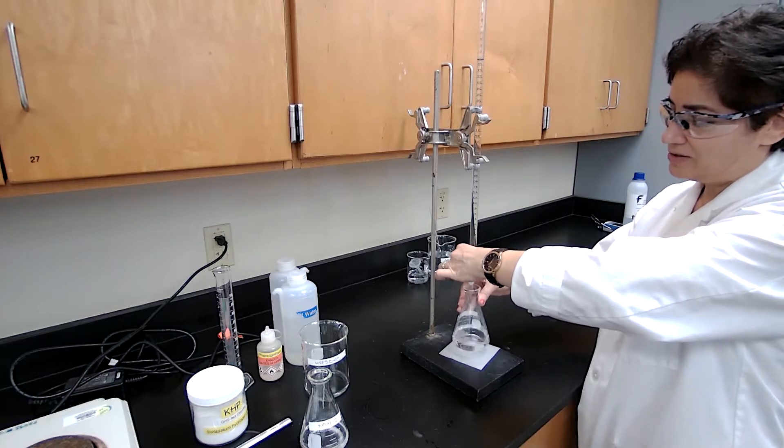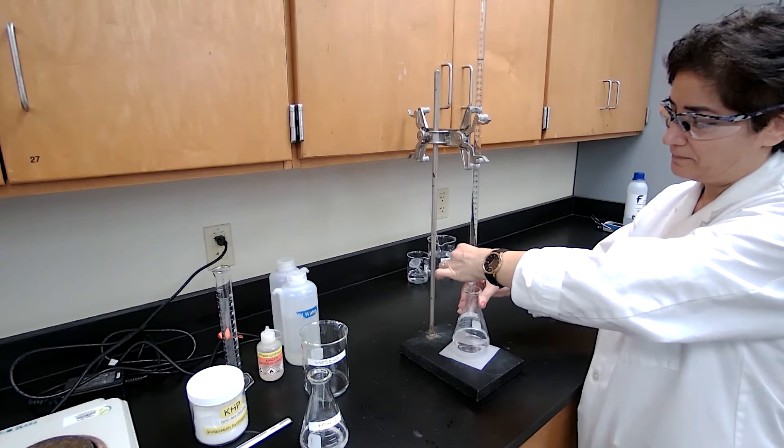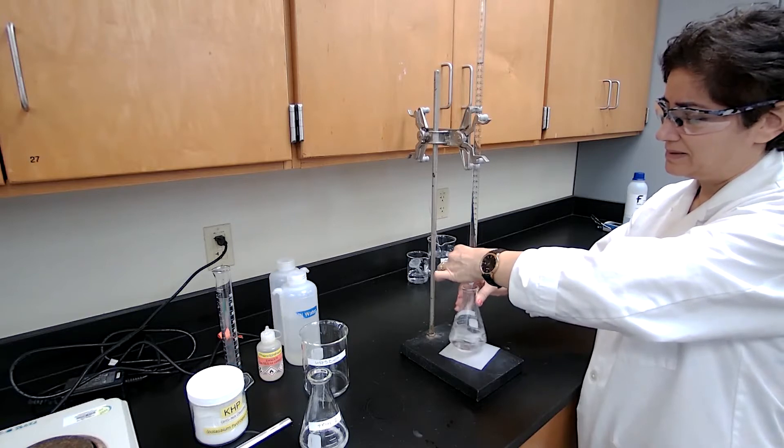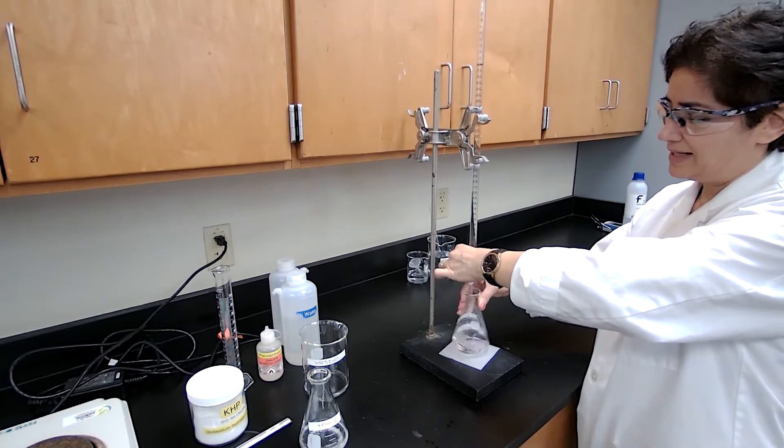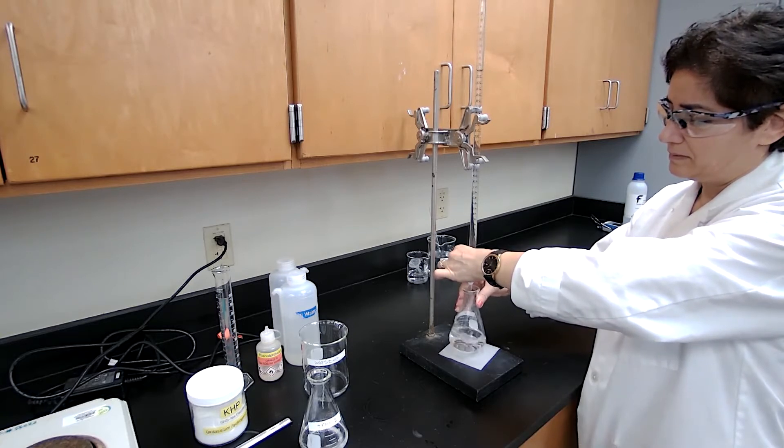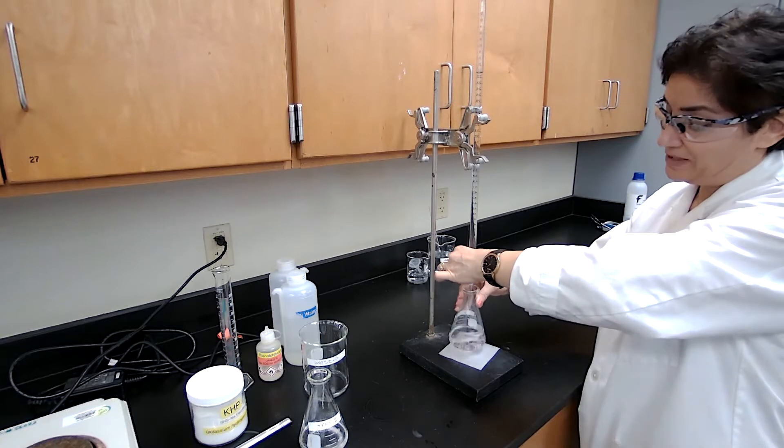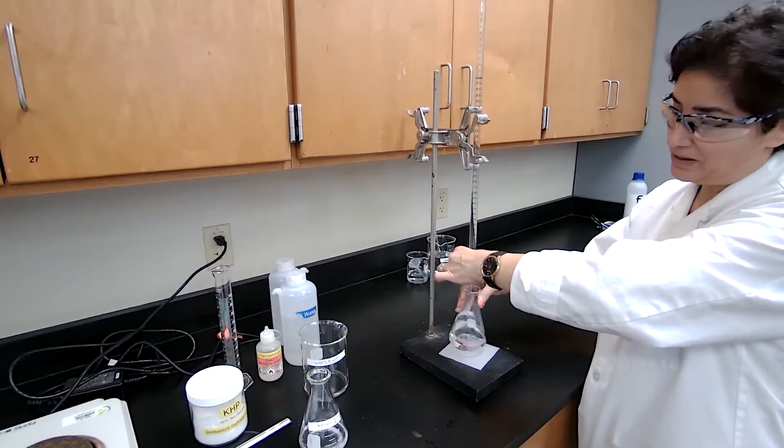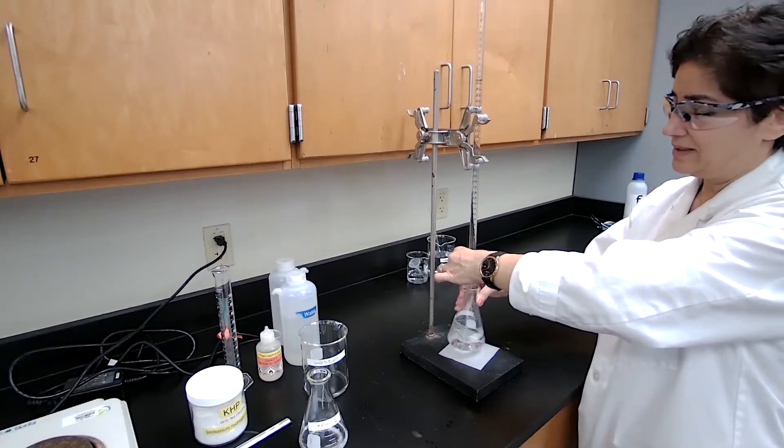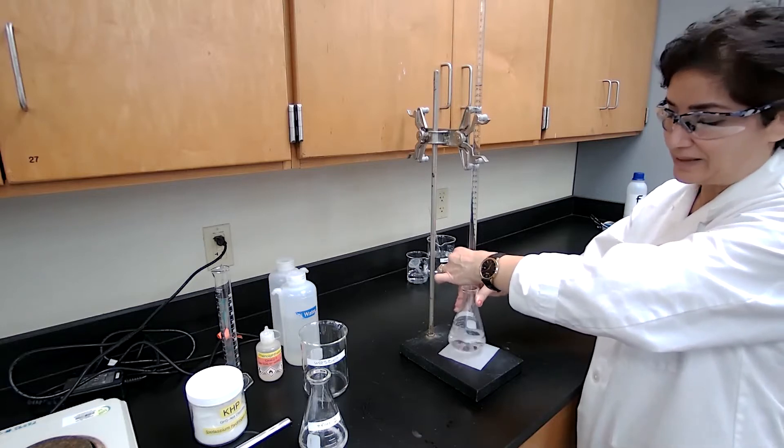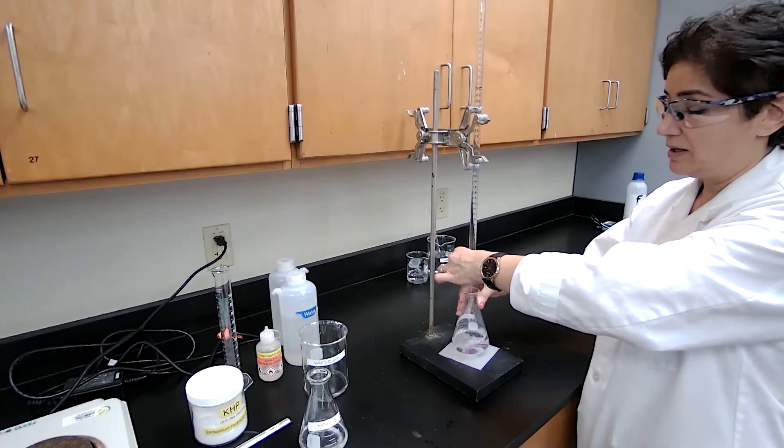So I try to add slowly, one drop at a time. The color disappears still, so I continue adding. You have to be patient. Sometimes you are not patient with this. When you add too much, you get too dark of a pink color. You don't know that it happened with which drop. You have to repeat the experiment, which is okay. That's why we have the optional third trial.